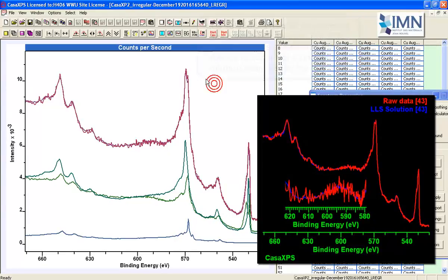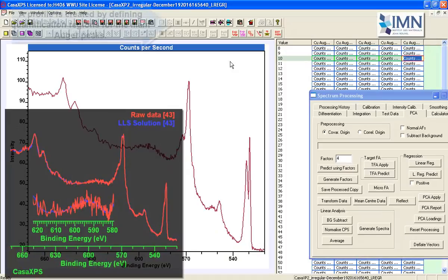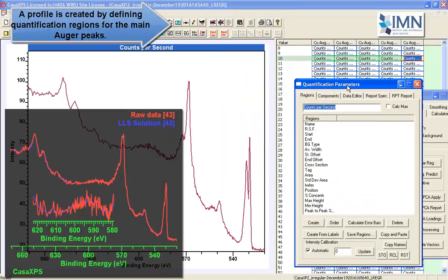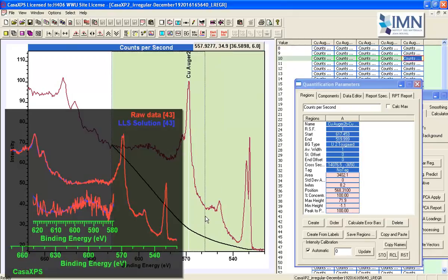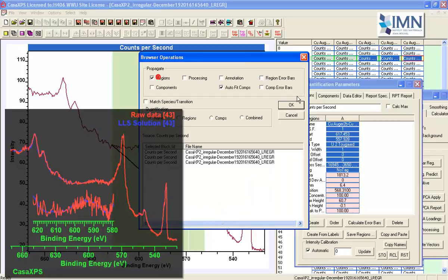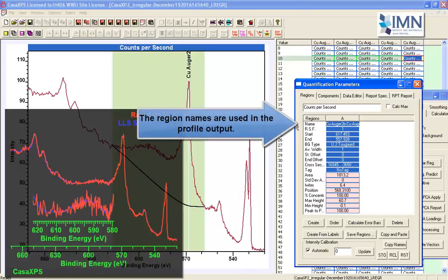And you can see that we've actually reproduced the data very nicely, and it's much smoother than the data itself, and that's because of the PCA calculation. If we hadn't done a PCA calculation, you'd have found that the basis functions would have been much noisier, but because we had such a large data set, we were able to remove an element of the noise, because we really had invested a significant amount of time in the acquisition process. If you just focused on one particular spectrum, you would not take advantage of that acquisition time, but the PCA has been able to do that.